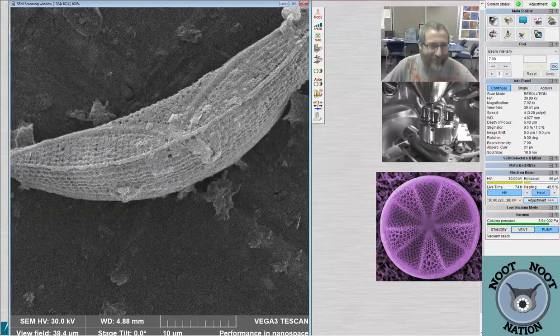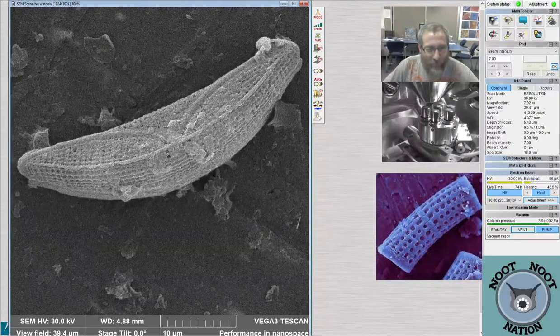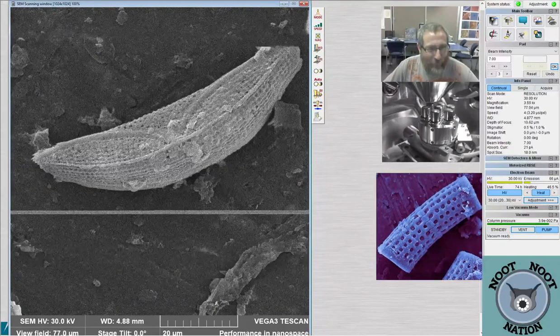Oh, that one, that beautiful one from the other night. It's not the croissant. Epithemia. Epithemia is right.